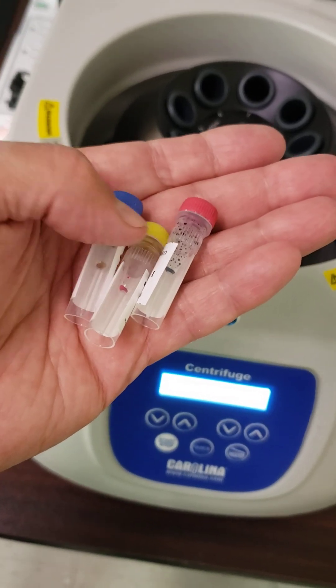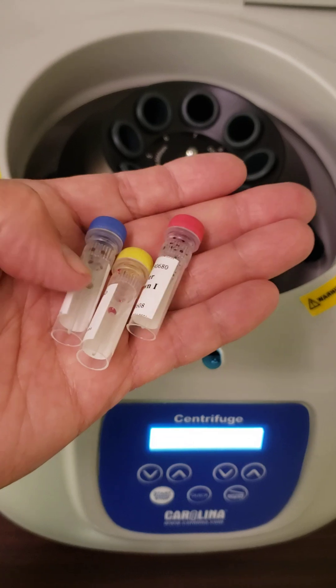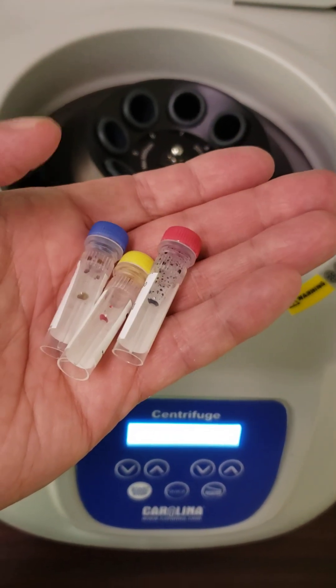Let's pick up a little experience with the centrifuge. When we do our gel runs next week, notice that we'll run an unknown against a couple of knowns.